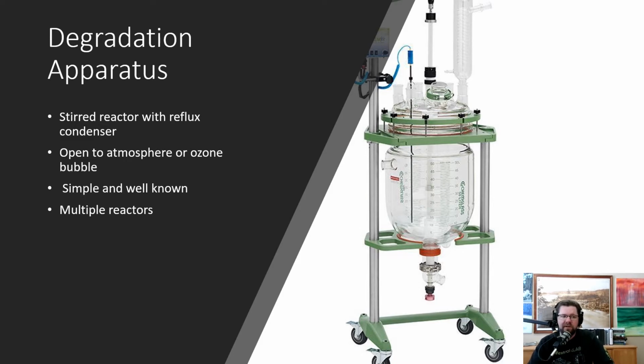It's simple, it's well known. A lot of people can use it, and you can use multiple reactors if you want to go really slow and a long time, you can do that. So that's the type of thing that you would use with a degradation apparatus.